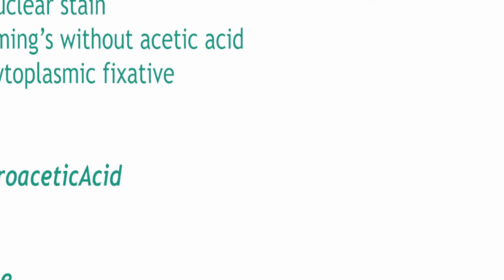Okay, let's talk about osmium tetroxide. Osmium tetroxide is also known as Flemming's chemicals, Flemming solution, or Flemming solution without acetic acid.